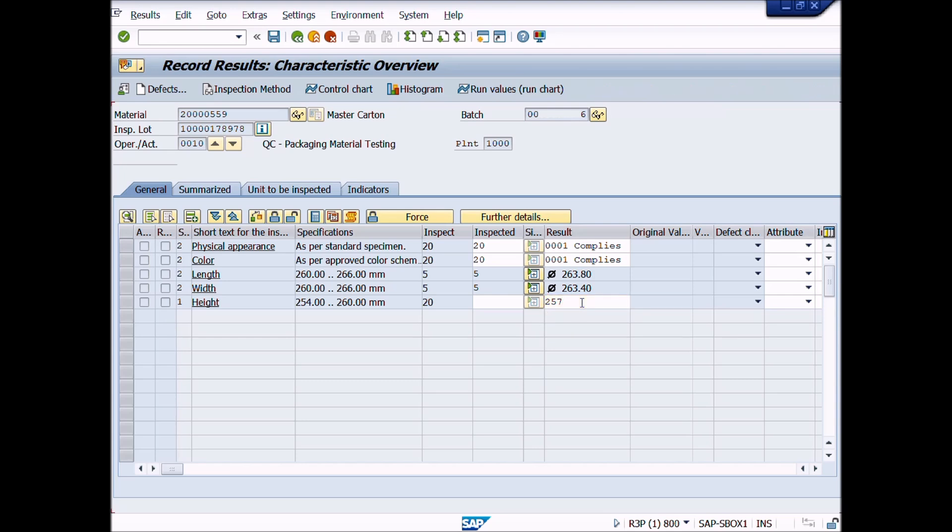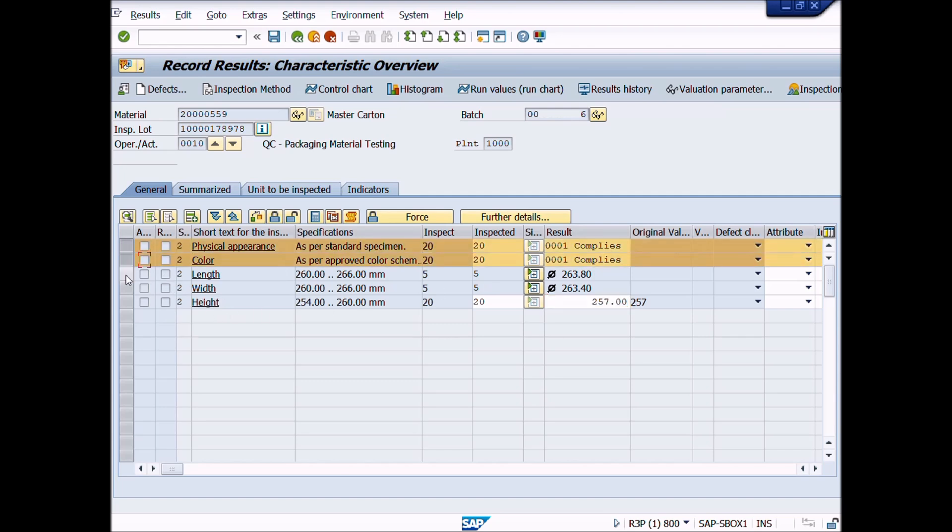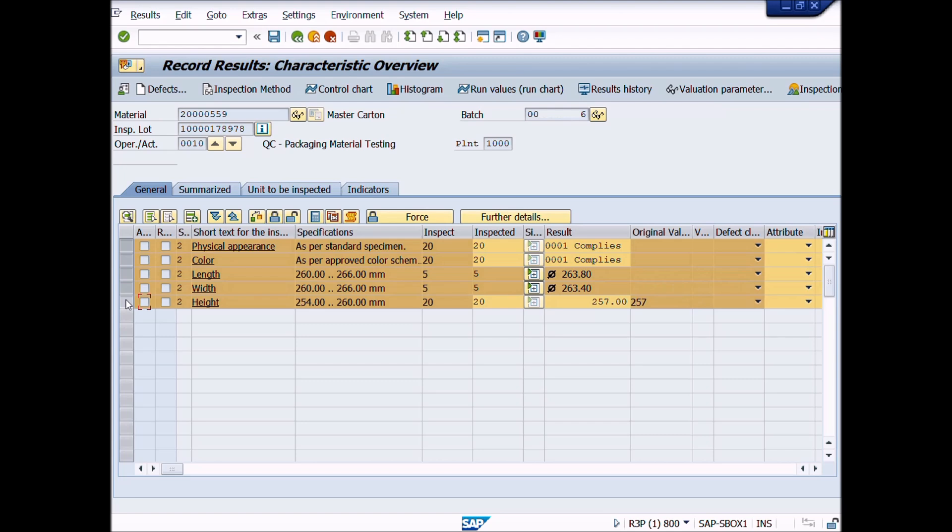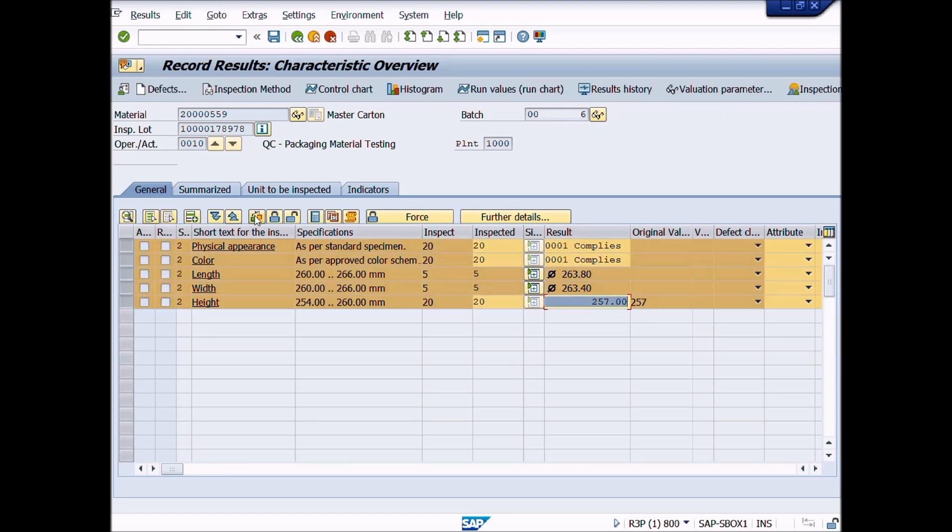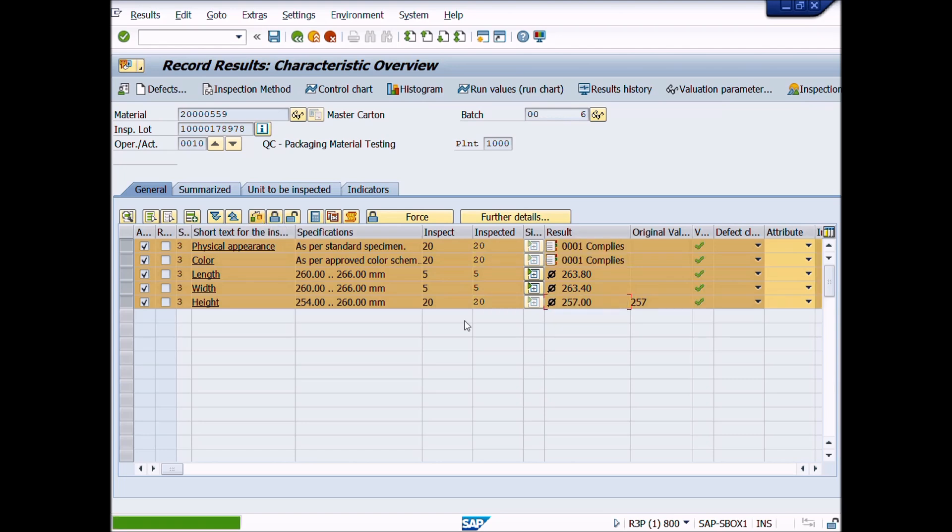After completion of entries for all inspection results, we will select all inspection characteristics. Now we will click on Valuate button so that the system can valuate the inspection results. Here you can see that the system has valuated the results successfully. A message appeared that the valuation was successful. Then we will click on save button to close the results.